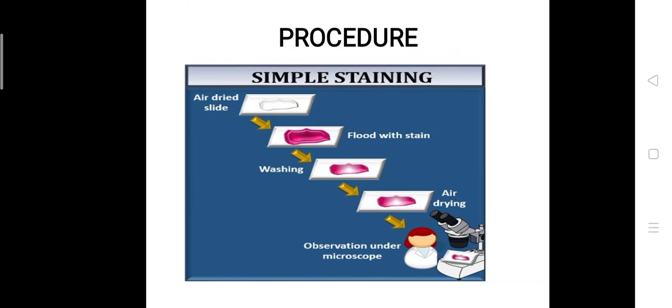After staining, gently wash the smear with tap water to remove excess stain. Hold the slide parallel to the stream of water to reduce the loss of organisms from the preparation. Then, using bibulous paper or blotting paper — or tissue — blot the slide dry; do not wipe it. Then examine the stain under oil immersion.